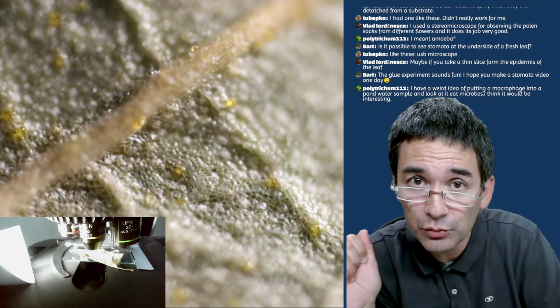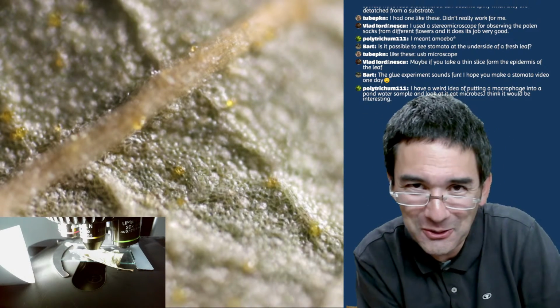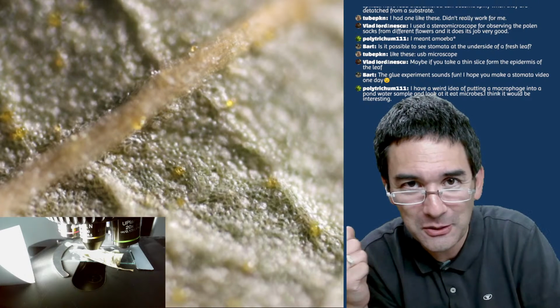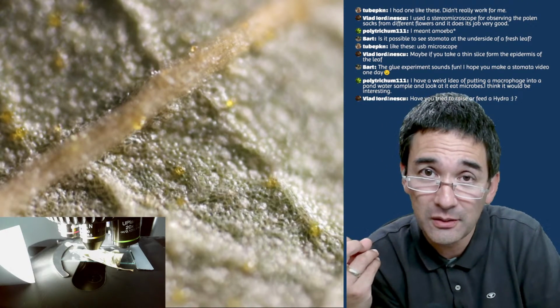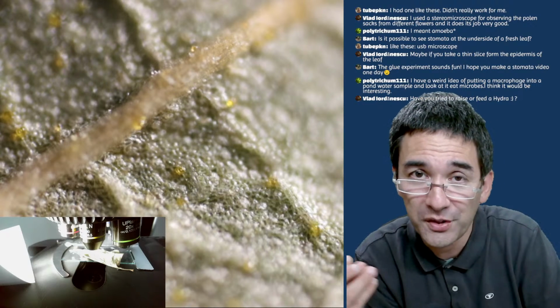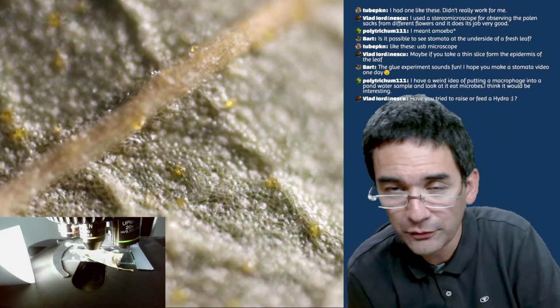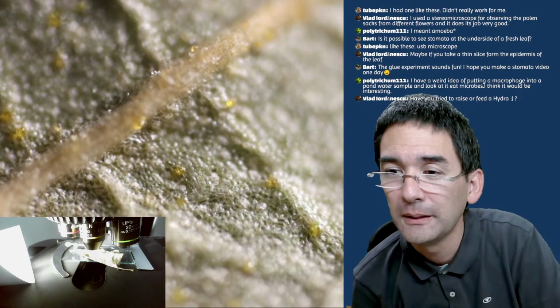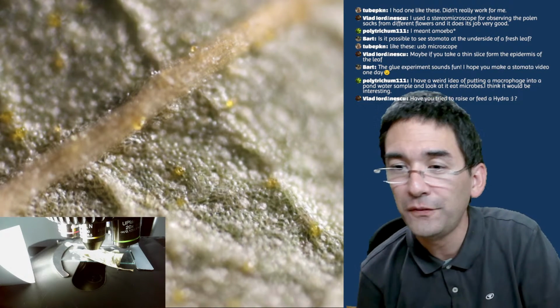You can get freeze-dried yogurt bacteria online, on Amazon, or you simply take yogurt, and then you're able to see those bacteria. And that is actually a recommended way, because when I, for example, do microscopy with students, I have to look at safety. Then you have to use a safe source of bacteria.